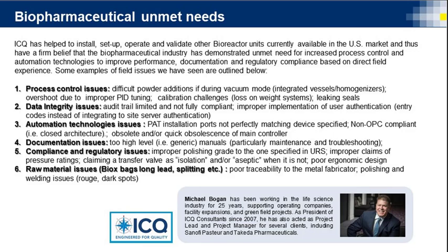Limited or no visualization of utilities supporting the bioreactor, a black box to SIP systems, CIP systems, or EMS systems. Poor selection of ancillary controls, valves, wet parts, and interfaces for your system opens the door for aborted cycles, product contamination, discarded batches, etc., due to gasket material, construction, agitator, RPM issues, or others.